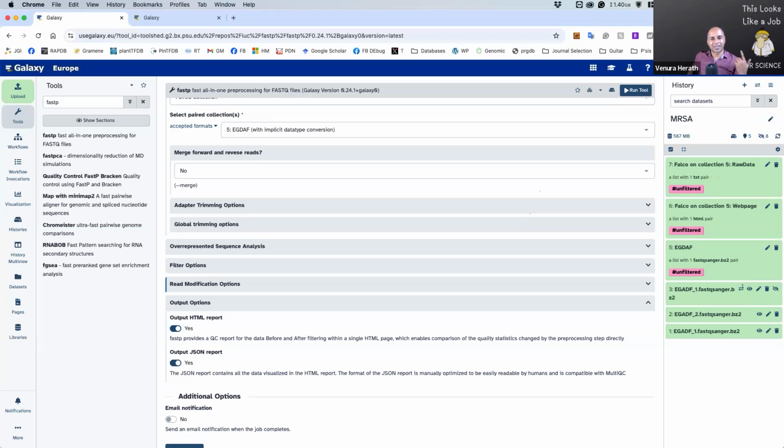If it asks for an authorization code or something like that, it should come to your email and then you can enter it. Also you can try clearing the cookies, that sometimes works. You have to try all those options, but it seems like your Falco is running.